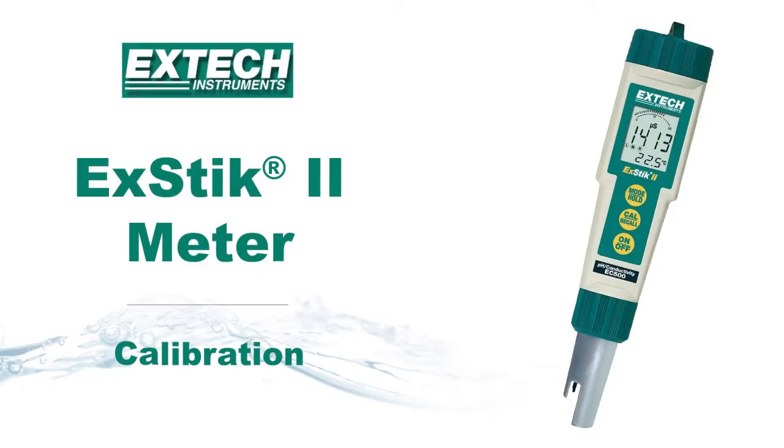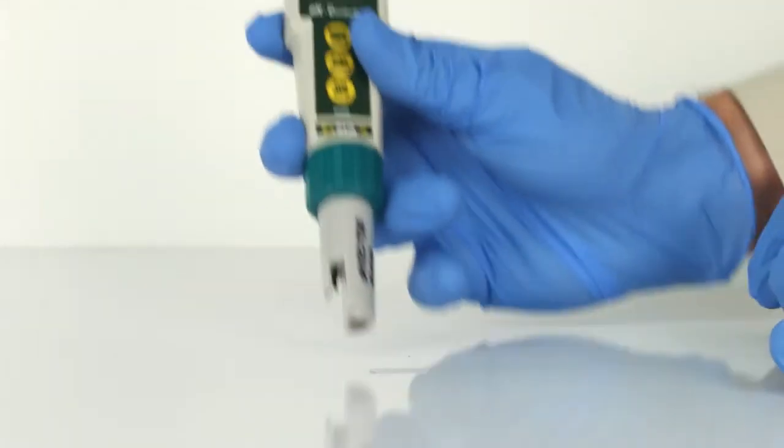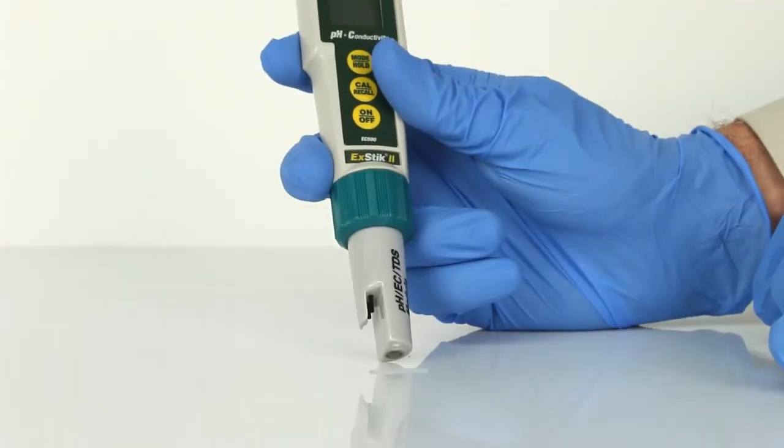This is a demonstration on how to calibrate the X-TIC 2 meter from X-TEC Instruments. Remove the cap from the bottom of the X-TIC to expose the pH electrode, reference junction, and conductivity electrodes.